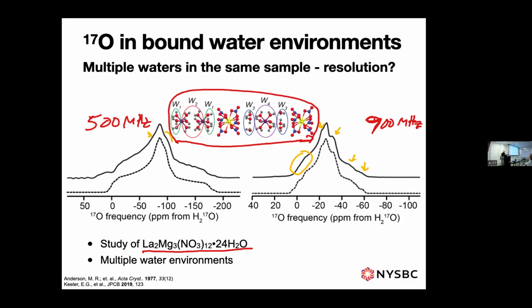I don't remember why we chose this particular one. It's an interesting system, but part of the motivation was that it is easily doped. So we actually did do some DNP on it. We gadolinium doped it and looked at DNP on the different nuclei.